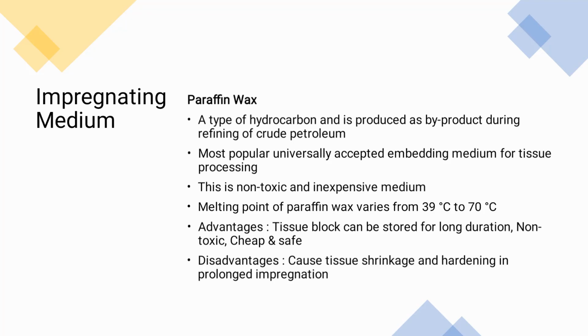The disadvantage of the impregnating medium is that when a tissue is placed in it for a long period of time, it hardens and the tissue shrinks. So the tissue should be placed in the impregnating medium for an optimum time. The bones and the eyes, the hard tissues, take a long time during impregnating. So these tissues should be kept in the medium for a long time as compared to the soft tissues.